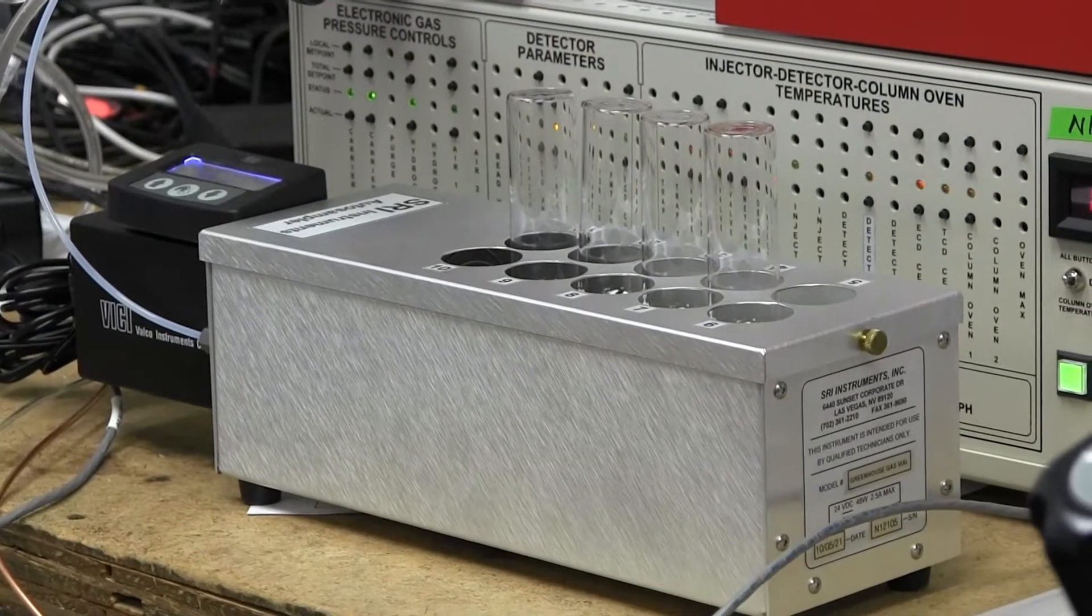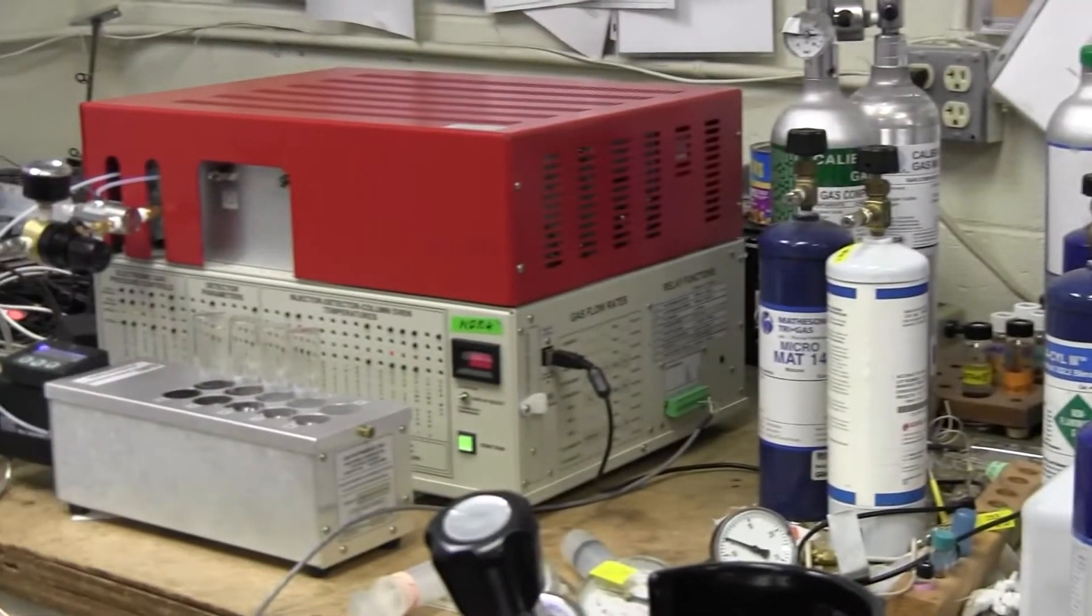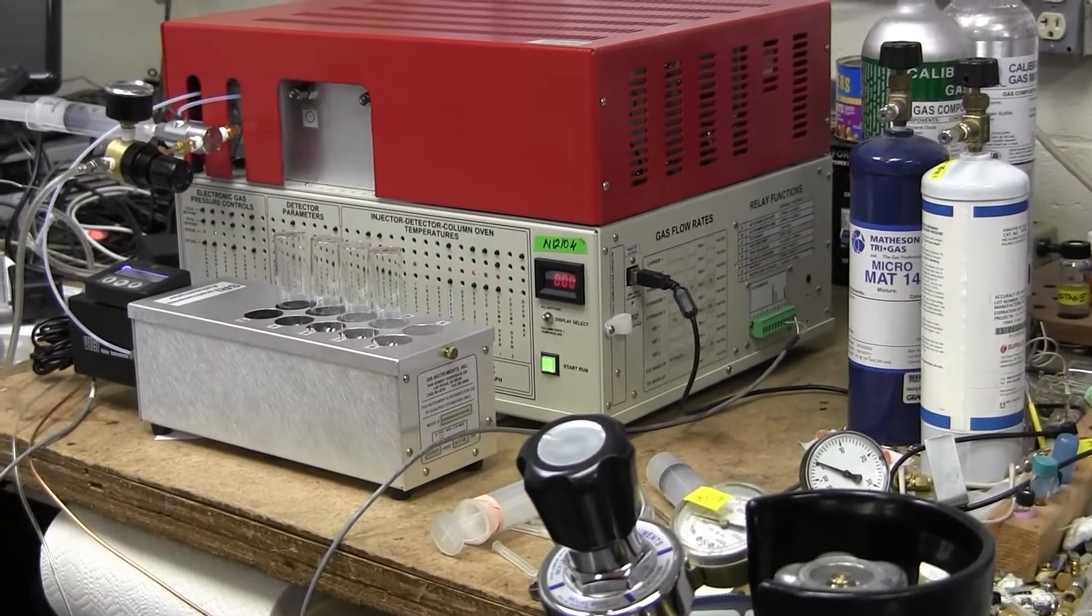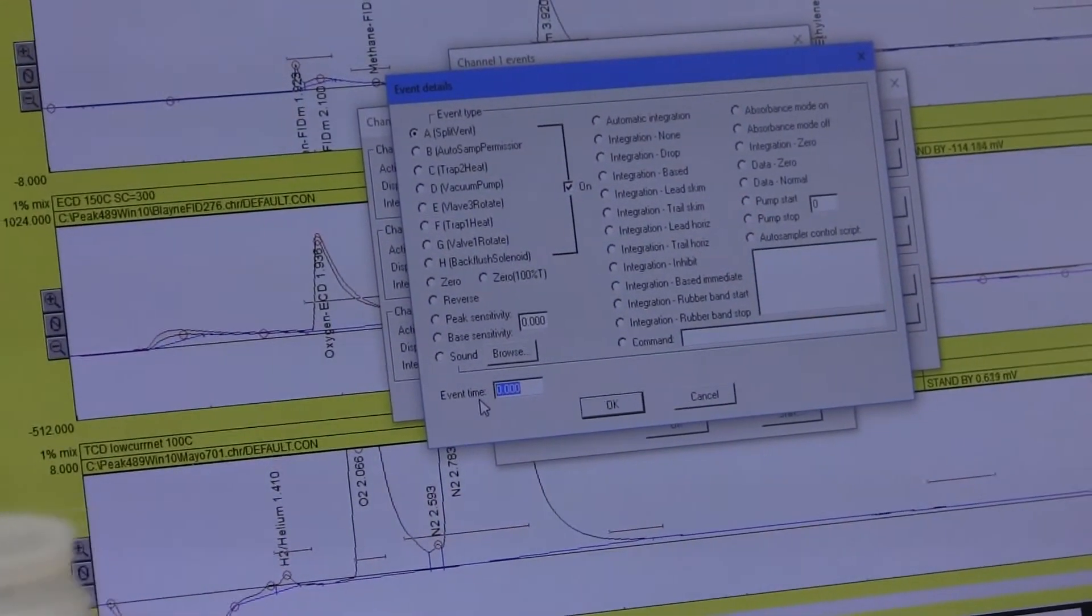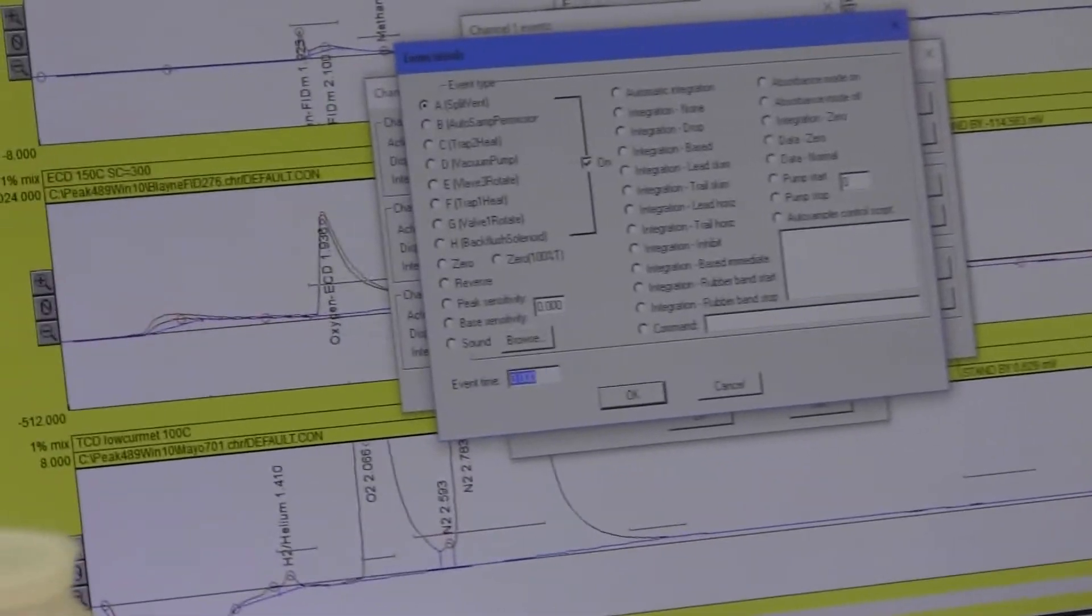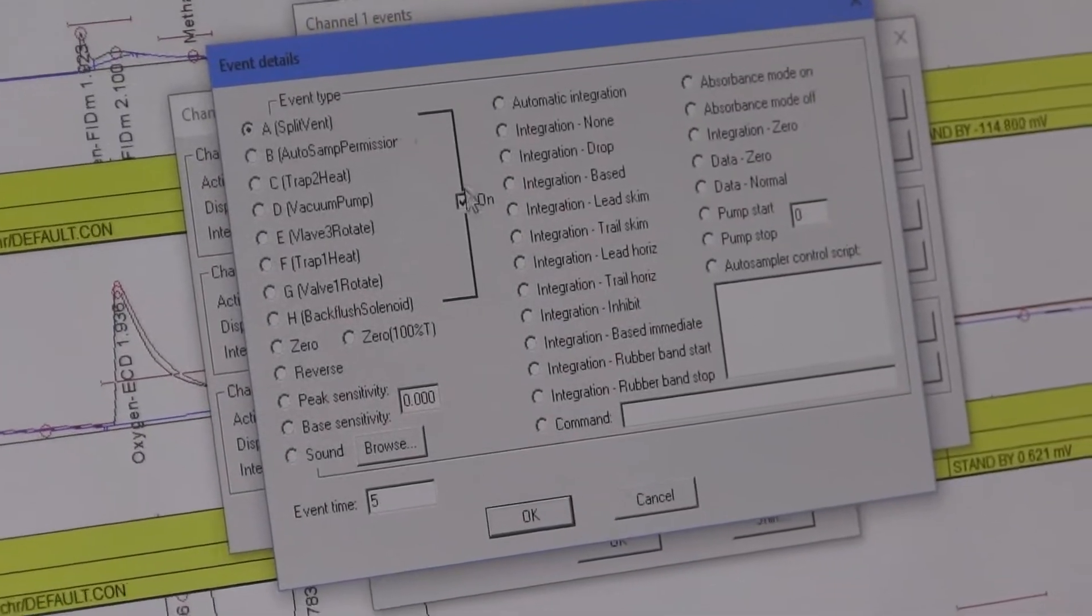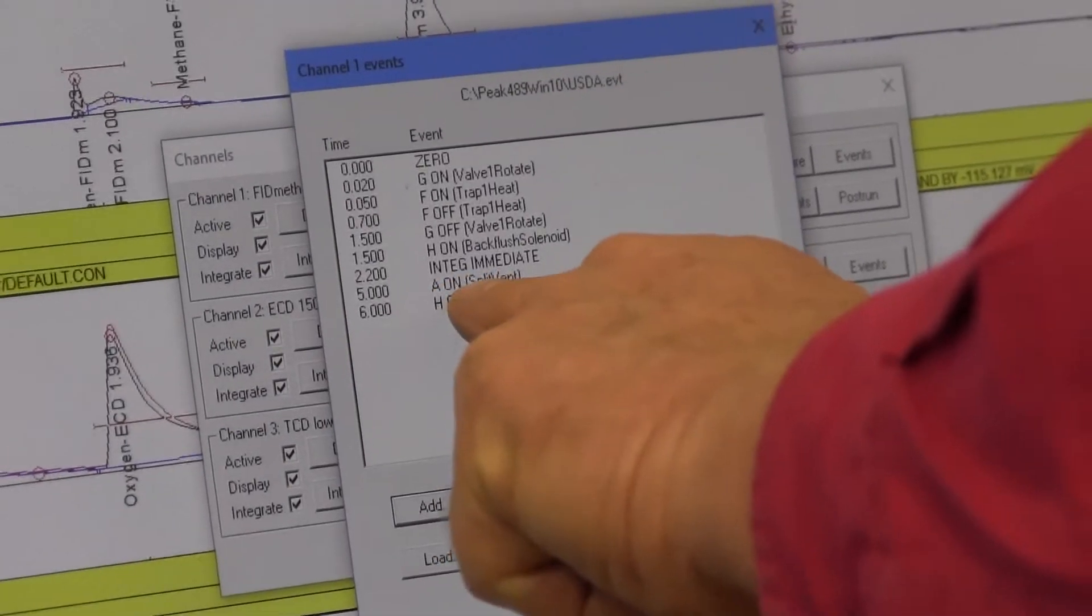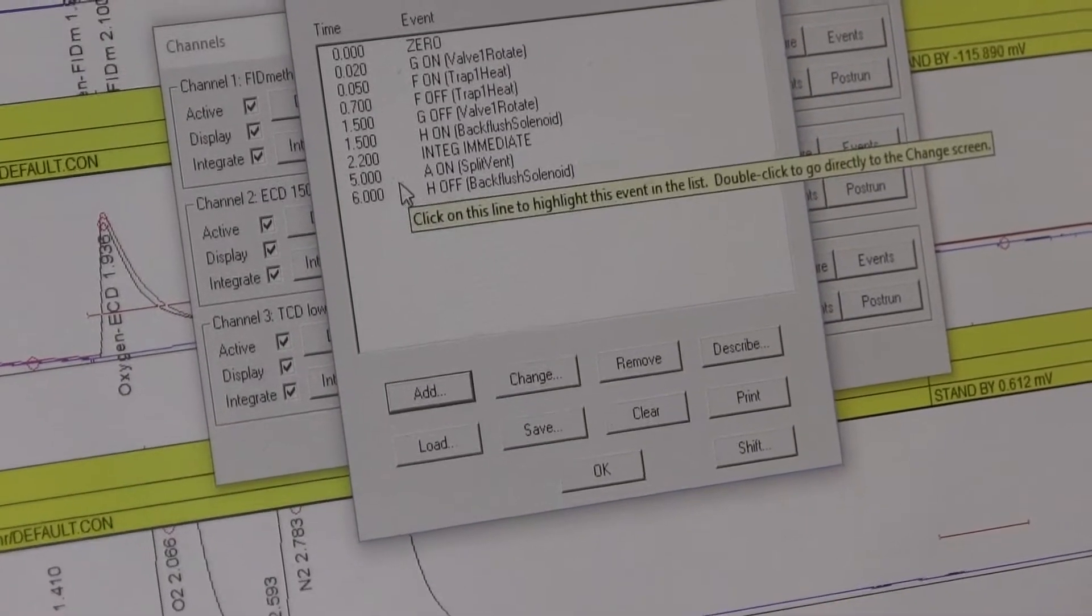So in the event table for your peak simple software, you go edit channels and then to the event table. So if I want as part of my method, I want to change the position from its current position, whatever that is to the next position, I need to add an event in the software. So I'm going to do this at five minutes into the analysis. Why? I'm just, it's just an example. Usually you do this at the end of the analysis or the beginning, but just to show the mechanics of how you do it. So you go to the event time, you put in the time that you want the event to occur, and then you click relay A and then on.